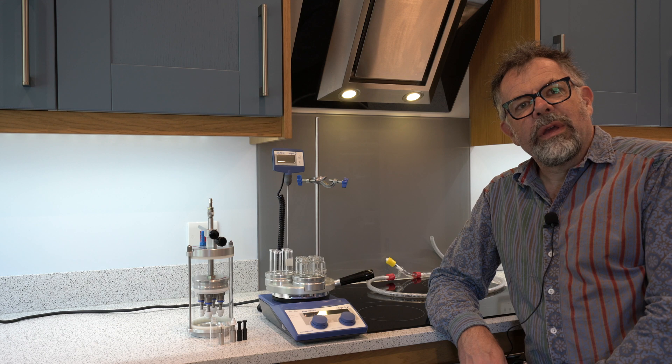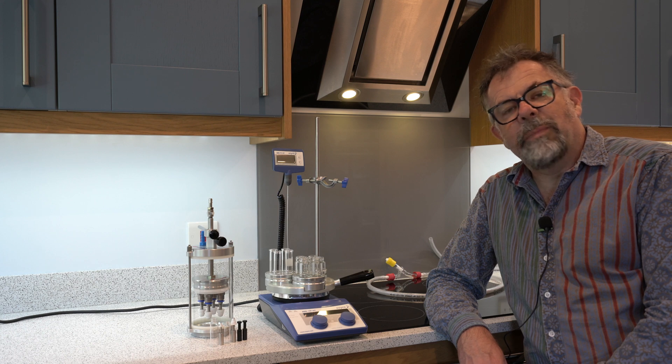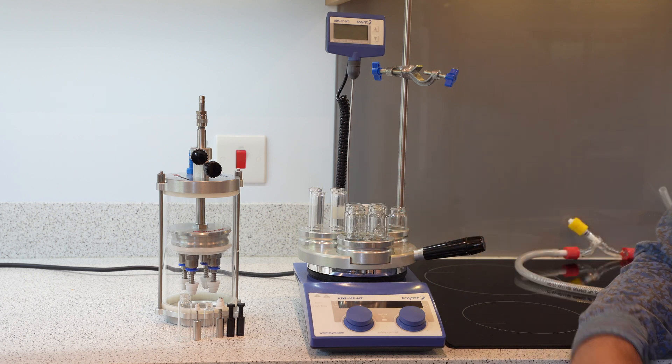We worked with them very closely and have licensed their spiral plug technology to make a parallel evaporator specifically for DrySyn heating blocks. Let me show you how it works.